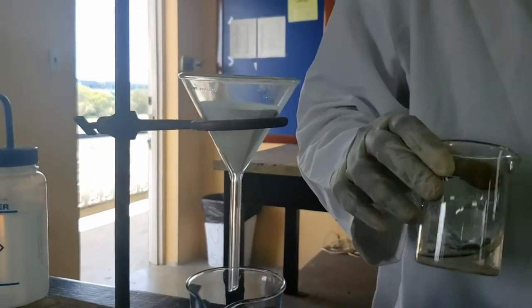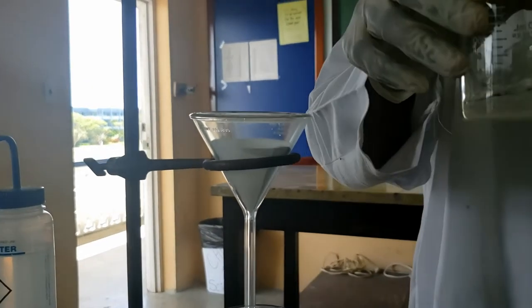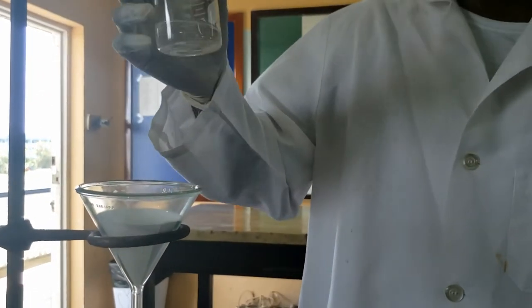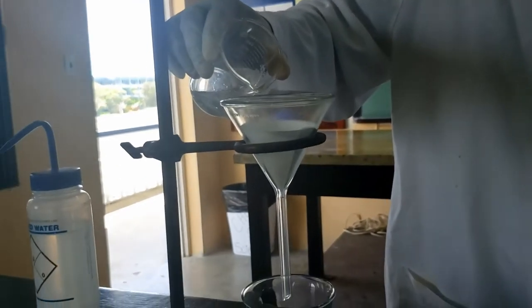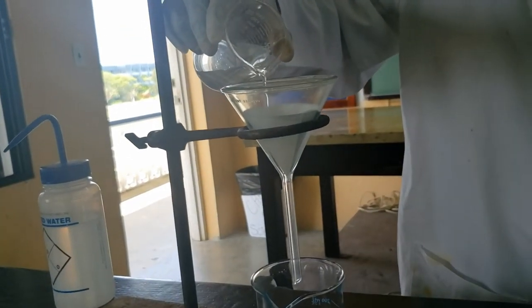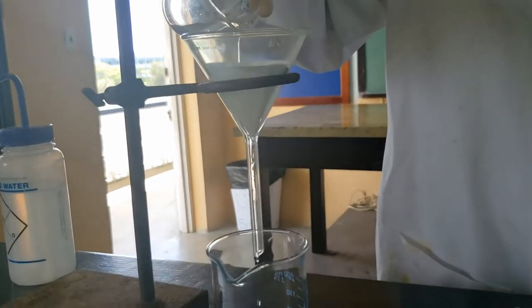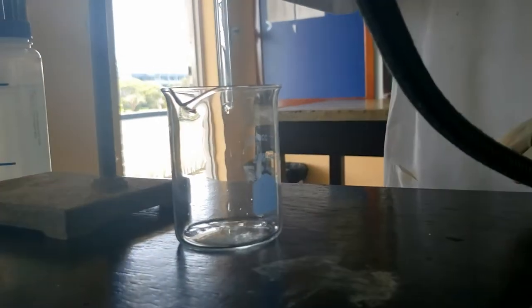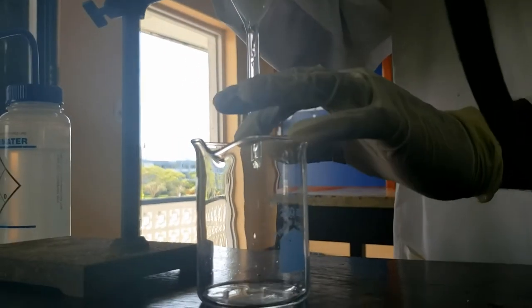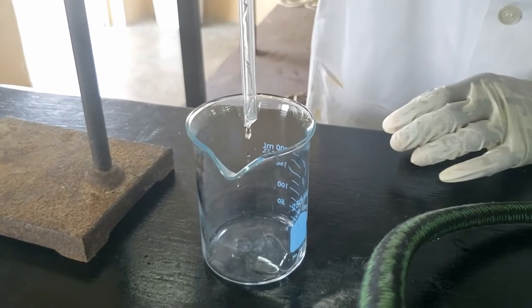Another piece of advice when filtering: if you have some solid that remains, it is advised that you decant first — so you let it settle, and then you just pour liquid through the filter paper. When there is no more liquid, the last thing you'll do is take your squirt bottle and wash the solids. So again, we just get the liquid through first.